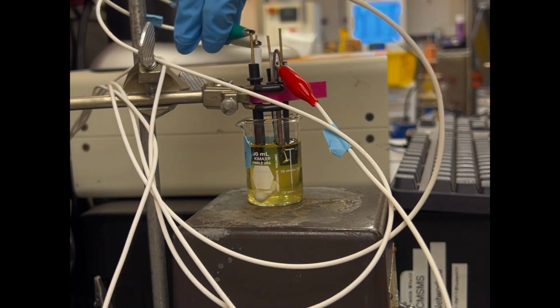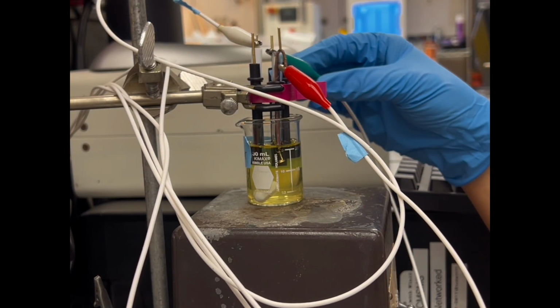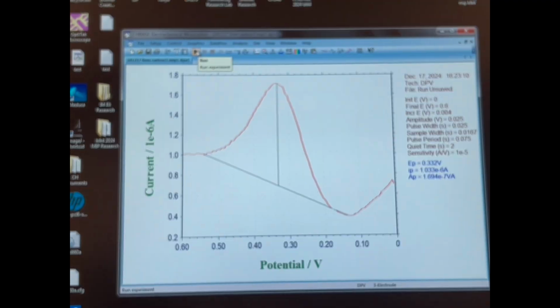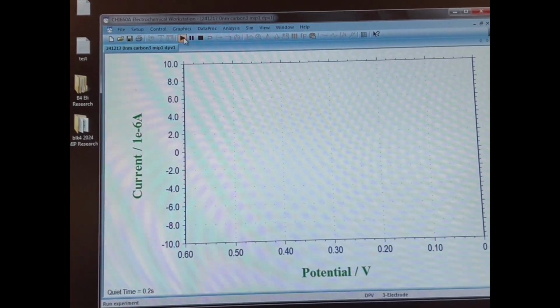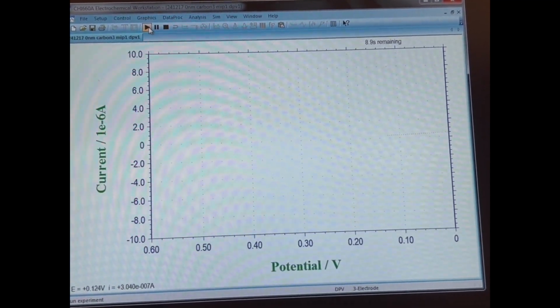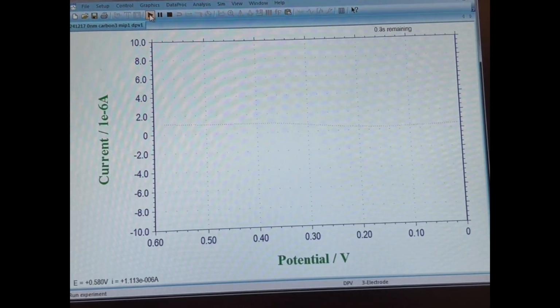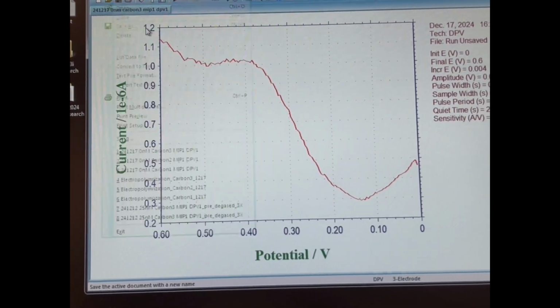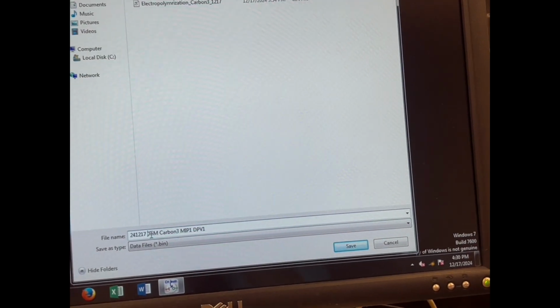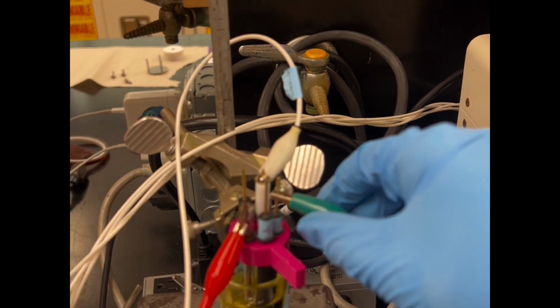And then switch it to the first electrode while it's still settling down. Then let it run after we make sure we save the previous document. Then save it and make sure we switch to the next electrode. Don't forget this step.